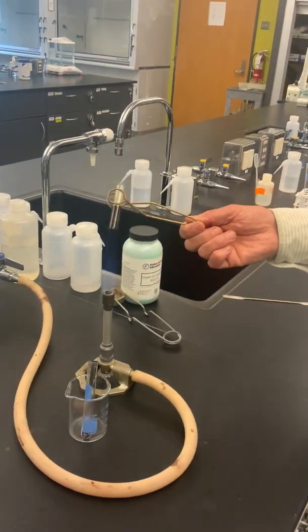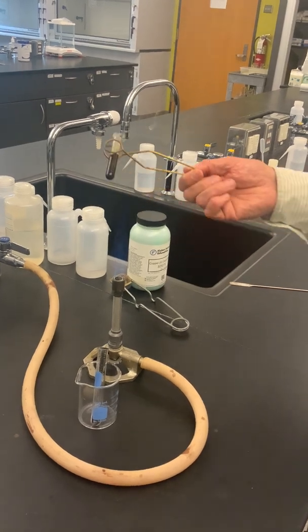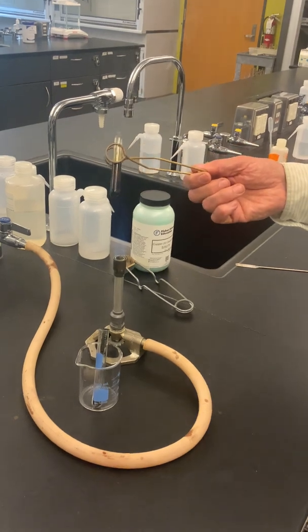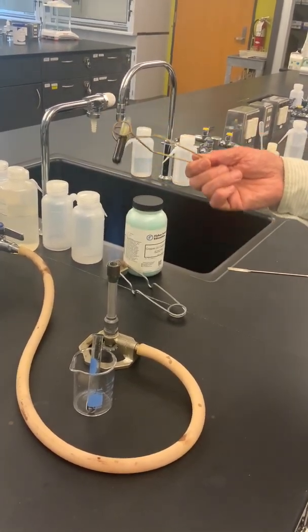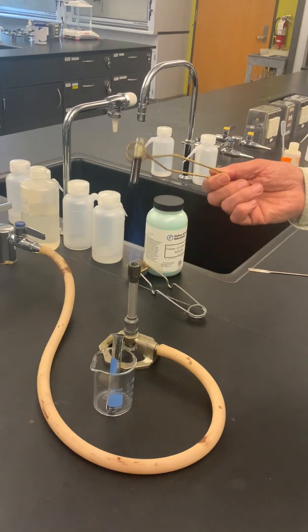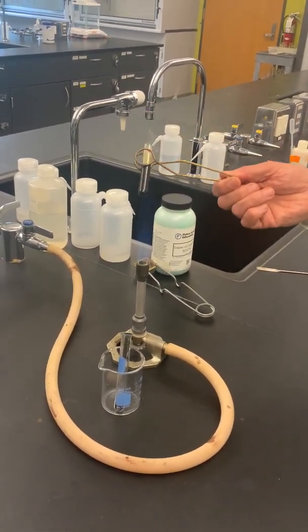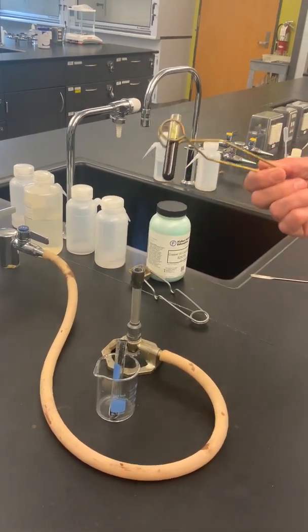And I'm just going to harp on a couple words he said. The difference between heating and burning is always an interesting conversation to have during this lab. So in the 2 experiments he's done so far, he's made it very clear that he's adding energy to facilitate the decomposition, which means we're heating it, and then later on we'll see something burned, which makes it a very different chemical reaction. So then there we have it.